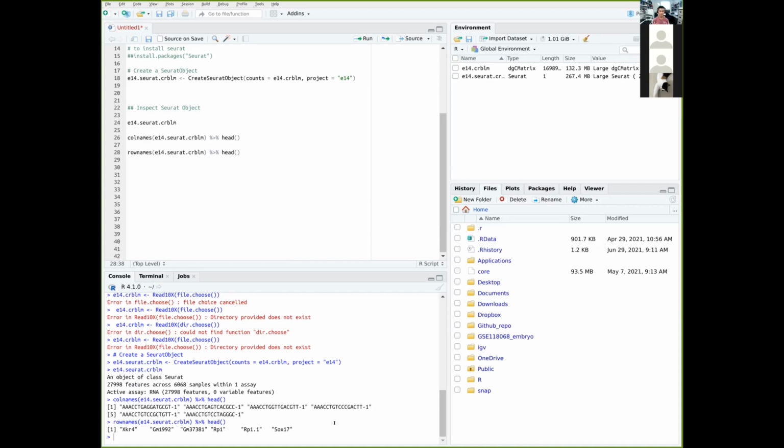The difference is that you can have genes coming from different gene IDs because they are found from a different locus, but they are expressing the same protein, same gene, so they will be named the same. And the reason why I prefer gene names is because downstream we're going to identify mitochondrial genes.